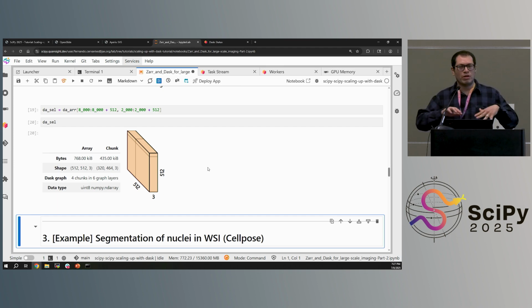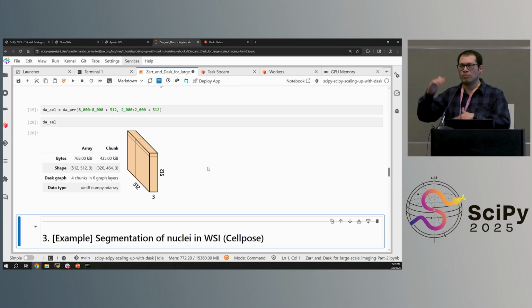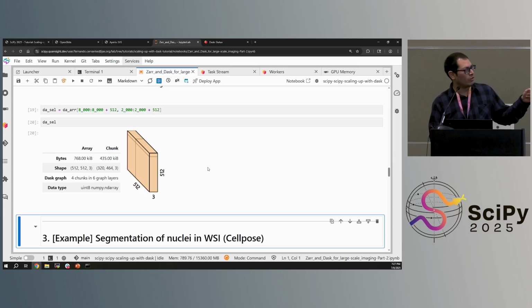You can reduce the noise in your image by applying a Gaussian filter, and then you will apply some thresholding operation to discriminate between those structures based on the intensity of your pixels. So going back here, there are these dark objects here. Those are nuclei of cells in this tissue image. So those are darker than the background. So you could apply a very naive image processing pipeline to discriminate those from the background. And that would require this set of operations.